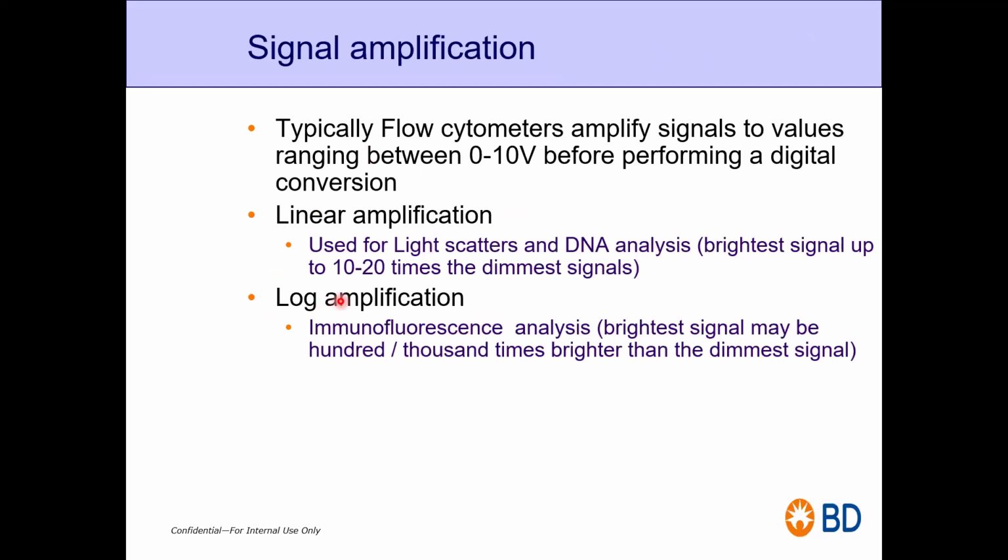So this is your simple signal amplification. It's the same thing as when you apply the PMT voltage and all. Again, I told you about the linear and log amplification. So why do we use linear scaling, and why do we use log scaling?